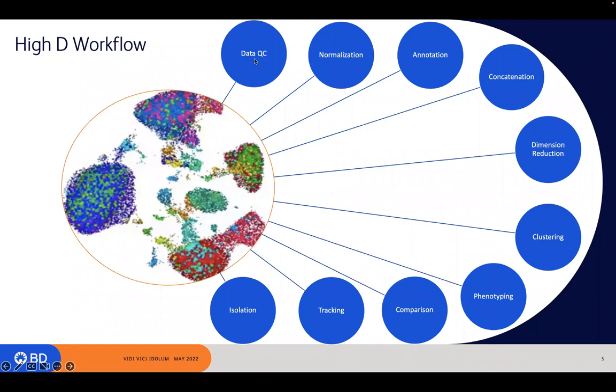This is the same for any flow cytometry experiment that you're going to come across, right? You have to inspect the compensation matrix on your cells. You have to get rid of doublets, debris, things of that nature, dead cells, because you don't want to feed dirty data into these algorithms. They're going to look at those dead cells and debris and discover a bunch of novel populations of cells that you've never seen before, and it's going to cause you to go on a wild goose chase.